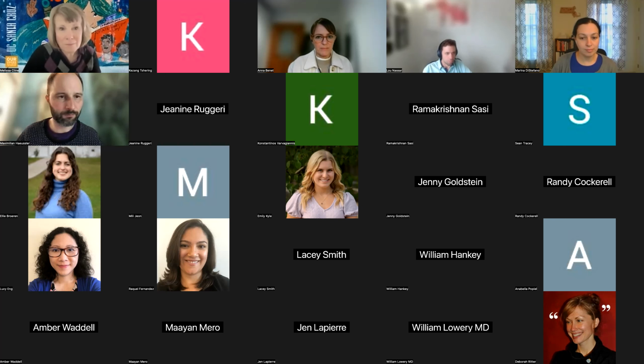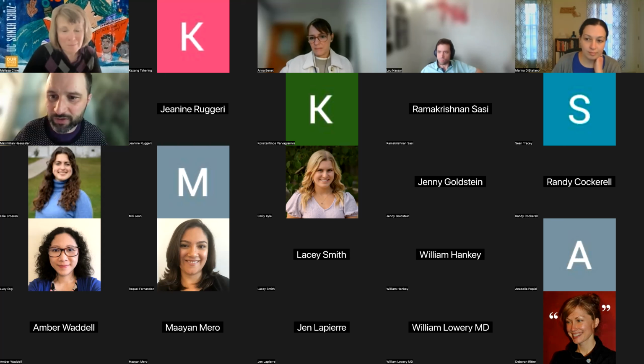And the other thing was getting that data into a format that we can send to UCSC, or that UCSC could get from the CSpec, which does have an API. It's just that some processing is needed on the input for that. So the problem for me with the hotspots is that it's an English text string that I can see, from the couple of examples I got from the chat. Okay, but I have to look into it, there are some comments now. It looks as if it wasn't really structured, but like English text, but we can look into that later in the details. Okay, I'll look into hotspots.